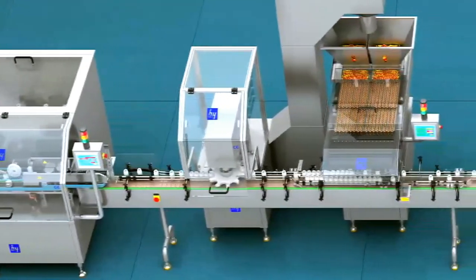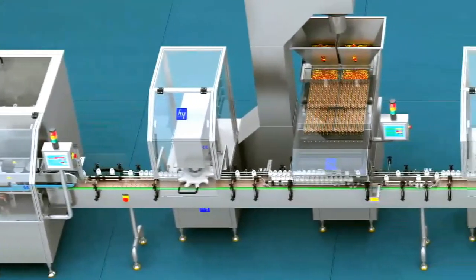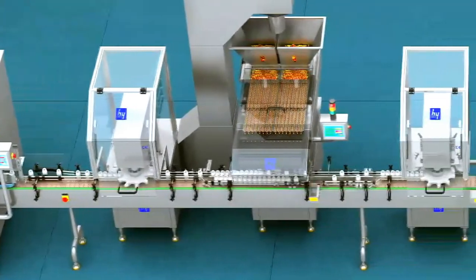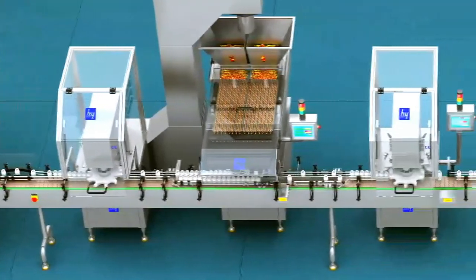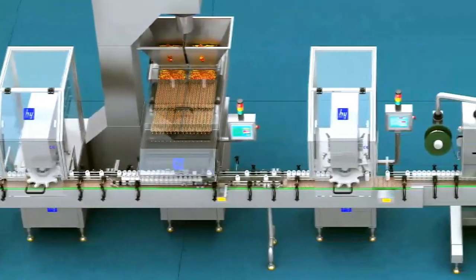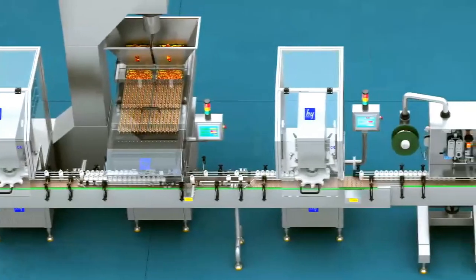This bottle packing assembly line can satisfy the bottle packaging of tablets, capsules, pills, as well as other similar solid particles.